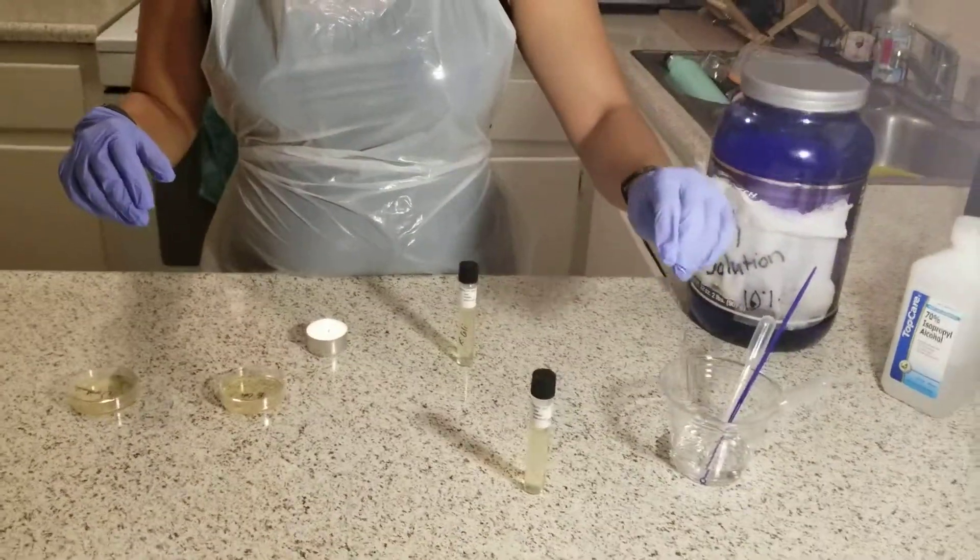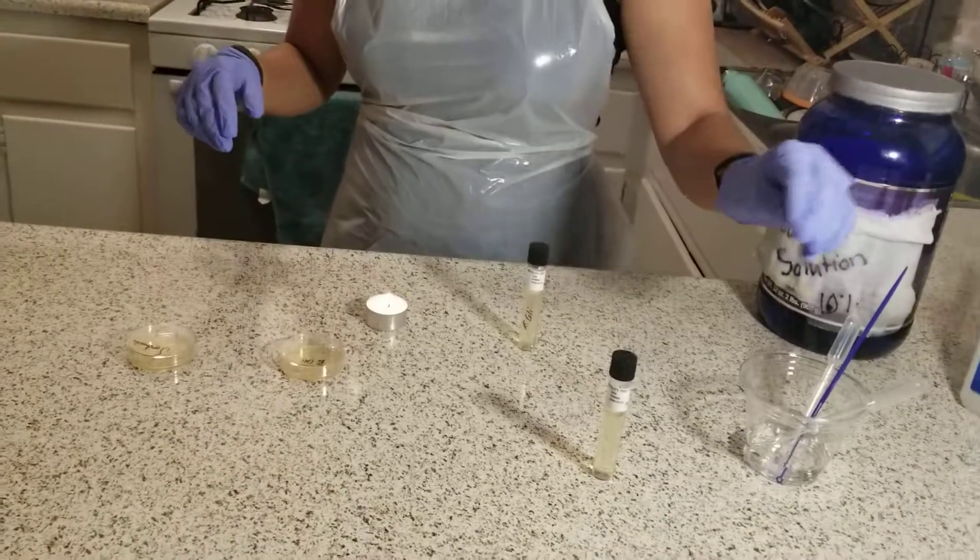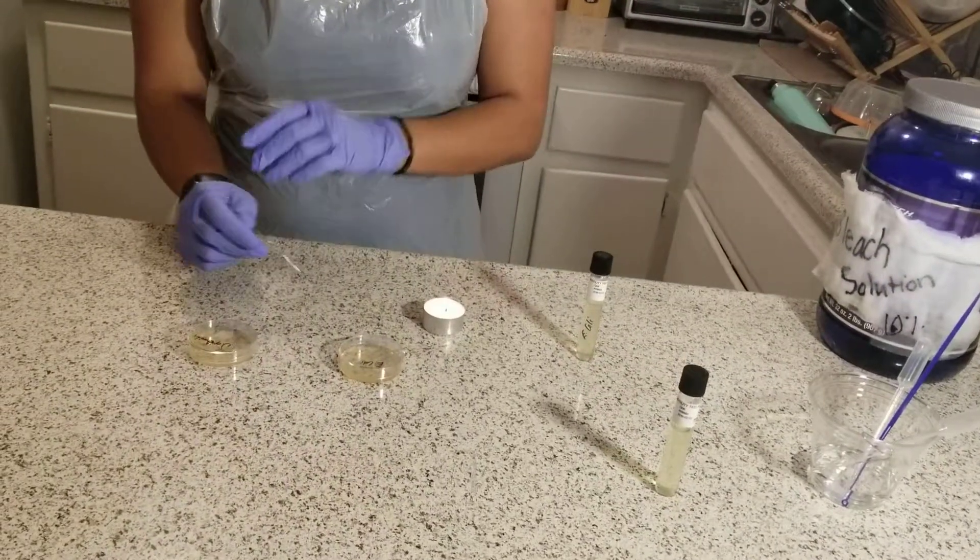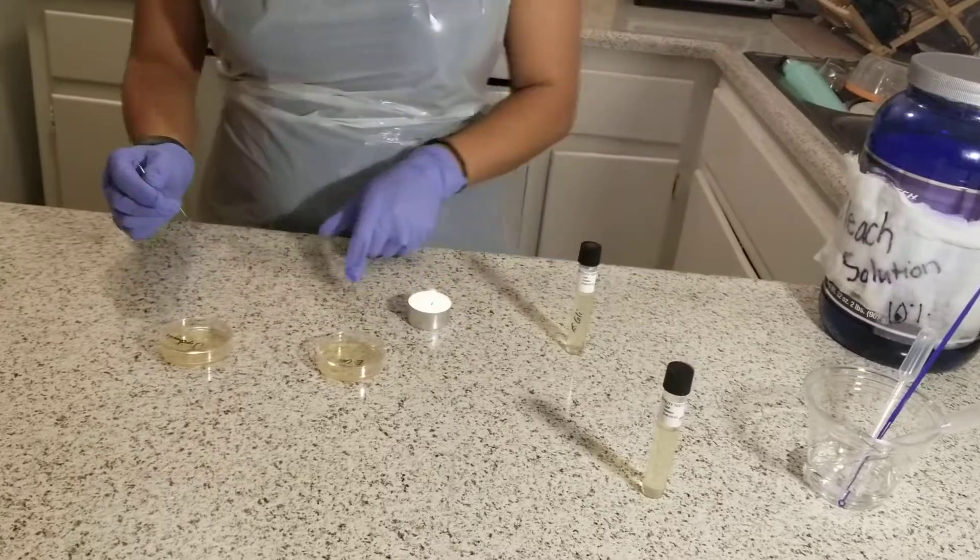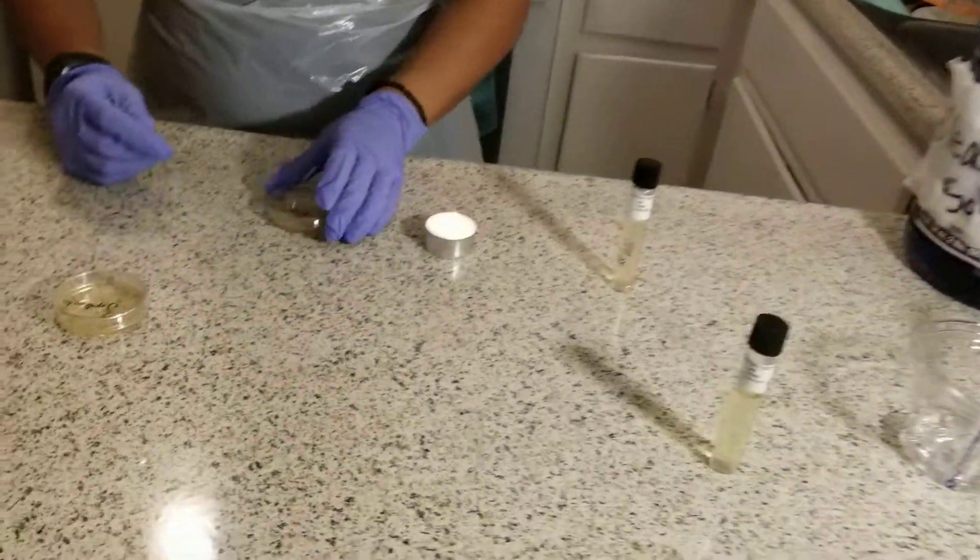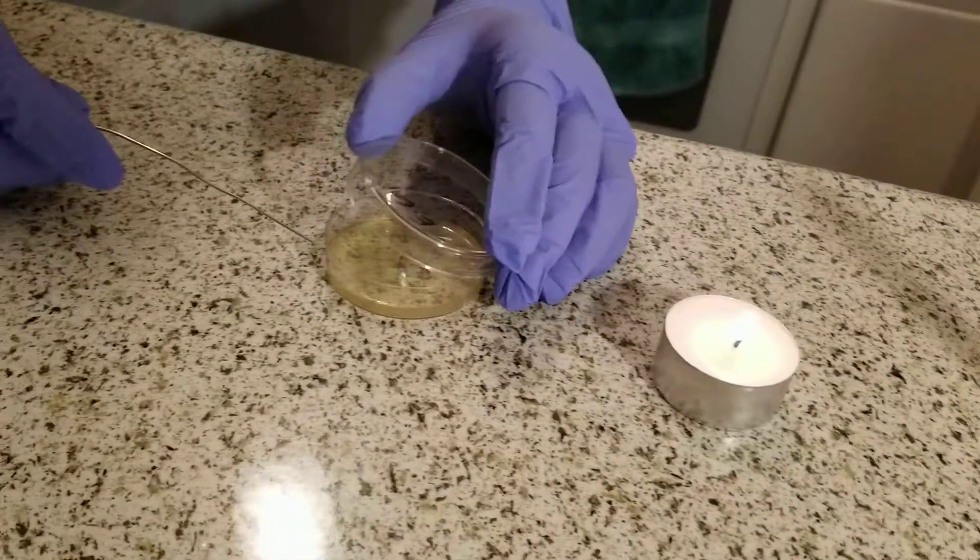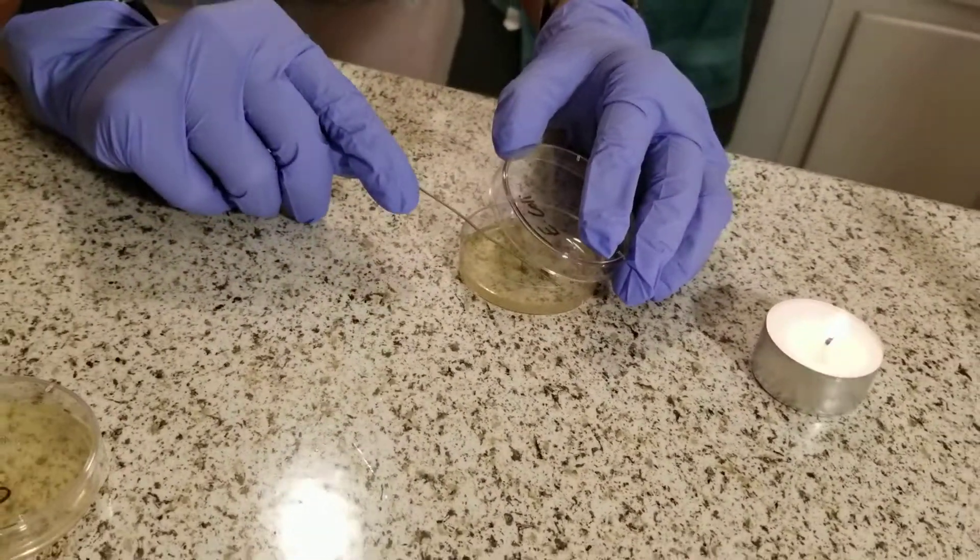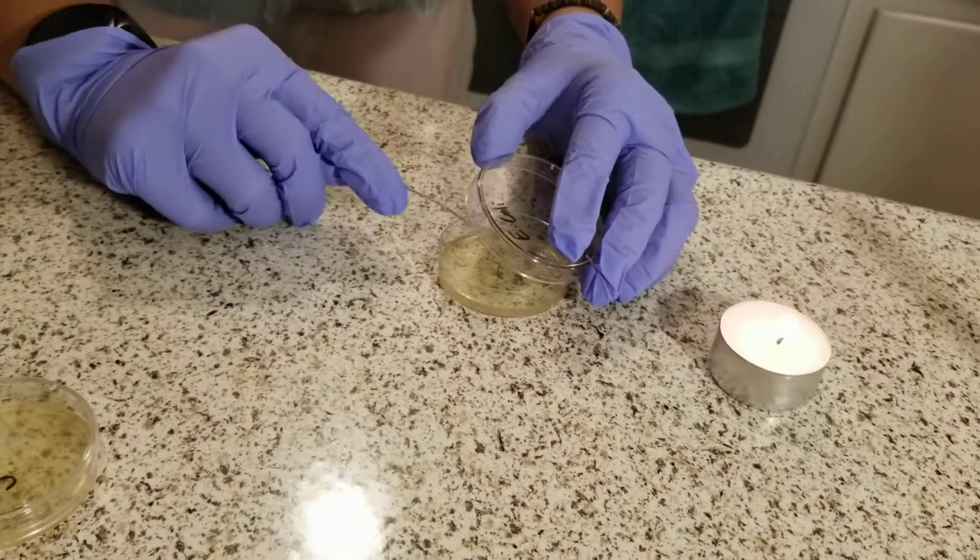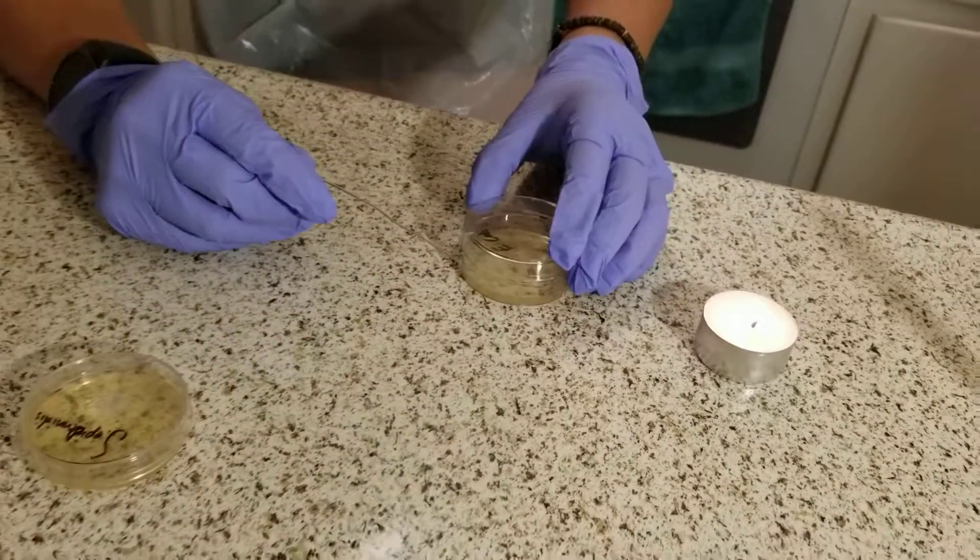Then I'll use my paper clip and put it into my E. coli plate. I'm going to swipe it across the surface to collect colonies, rubbing it against the surface of my agar plate.